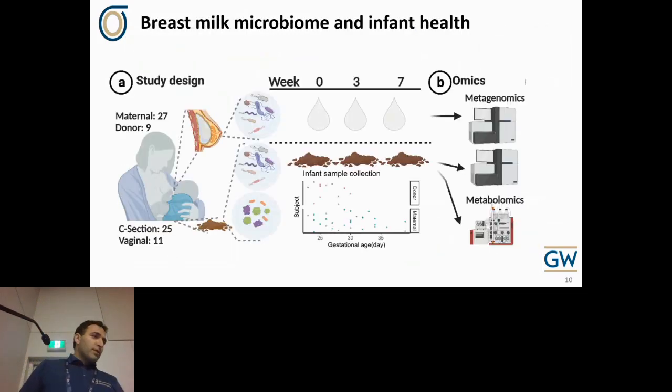All right, so I'm just going to show output, and I know I have a short time here, 10 minutes. I'm trying to cover everything. So here is one of the studies. In many of the studies in my group, we focus on metabolites and microbes. And this is one of the longitudinal studies. We want to characterize how the microbes and metabolites change over time and how they are associated with the clinical information we have about those individuals who participated in our study.